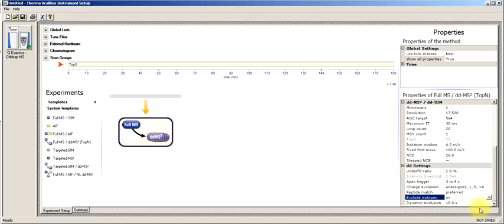exclude isotopes on as well, and your dynamic exclusion, just one setting here. I'd like to set that at half peak width. 180 minute gradient, I know on my column that's going to be about 45 second peak width, so I set this at 20 seconds for dynamic exclusion, and it'll try to do the apex triggering, but if not, then it'll wait 20 seconds to do the dynamic exclusion.